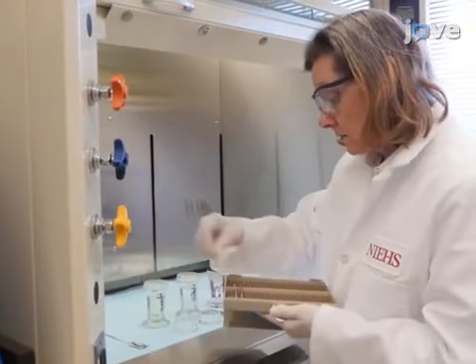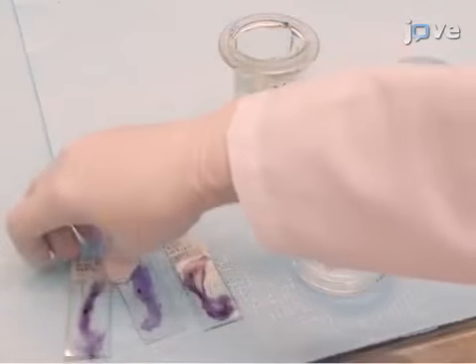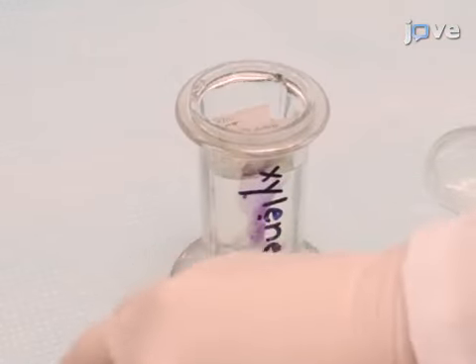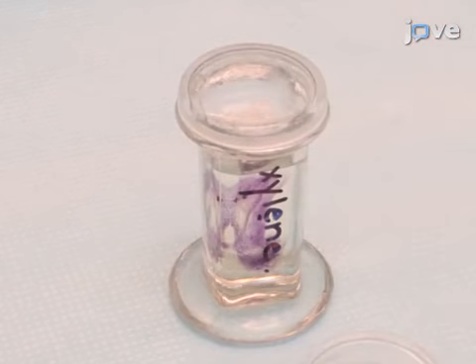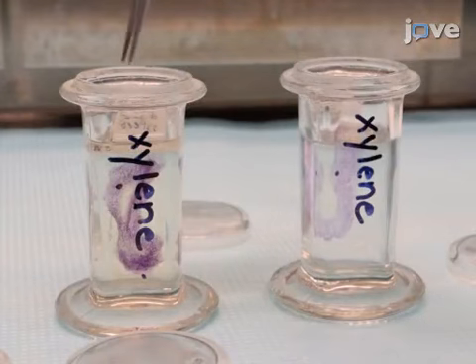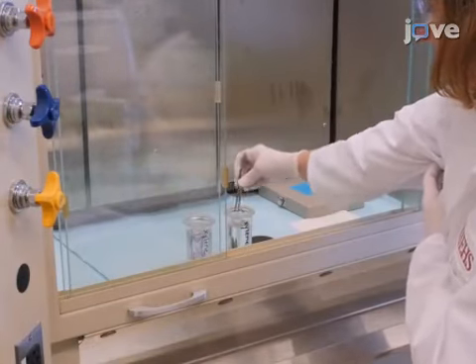After preparing hole-mount mammary samples and analyzing the tissue for abnormalities according to the text protocol, remove the coverslips and mounting medium by submerging the slides in a glass staining jar filled with xylene. Incubate overnight or longer. Transfer the slides to fresh xylene and soak the samples for six hours. Then transfer the samples again to fresh xylene and soak overnight.